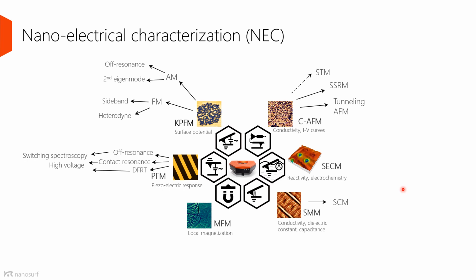I would like to close this webinar by showing again the first slide, with a slightly extended set of electrical modes. We have learned today about the six main electrical modes, and we have learned that many of them consist of a whole family of measurements, depending on the samples which need to be studied, the information that needs to be extracted, the requirements for the measurement sensitivity, and both electrical and spatial resolutions.